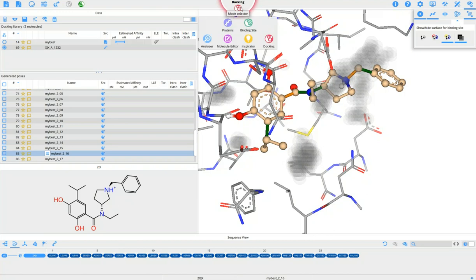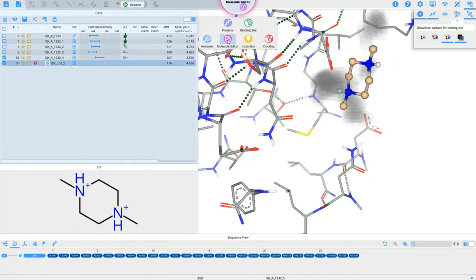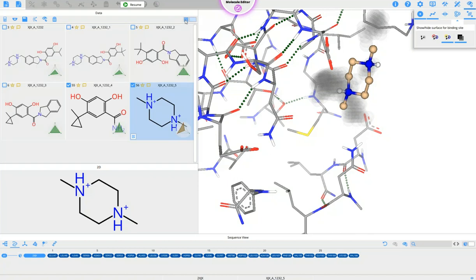I've shown nearly everything. I've just realized that I haven't shown you one little switch. On the tables where you have molecules, you have a switch here on top, which switches between the table view you have now and the grid, where you see all the structures in 2D directly, and you see they have little radar plots.